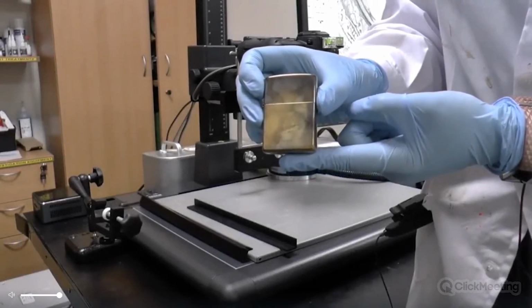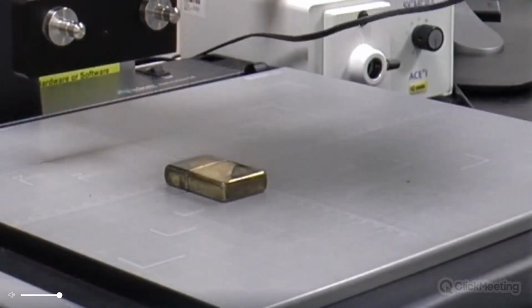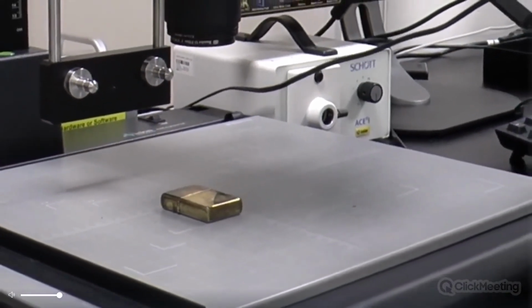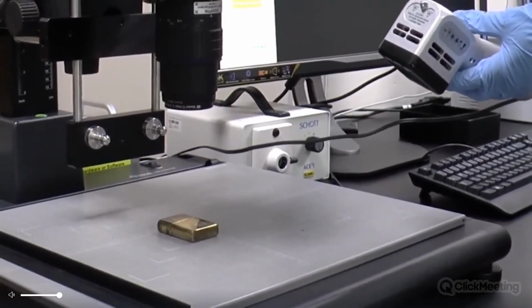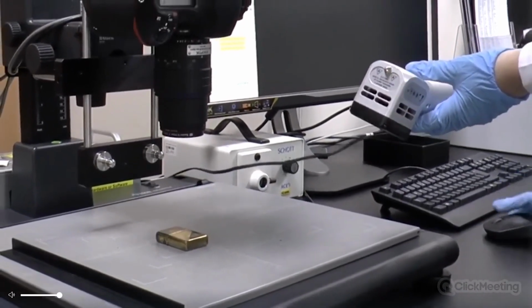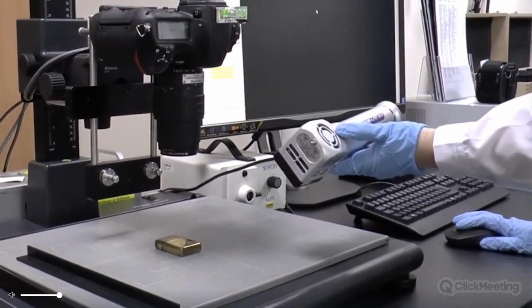Okay, so we have our DCS 5 imaging system. I'm going to take some of our samples that we've just treated in Recover and analyse them for finger marks. First, we have the lighter, and what we're going to use is actually a mix of different techniques across our range of evidence. First, on the lighter, we're going to try and use the reflective UV process.